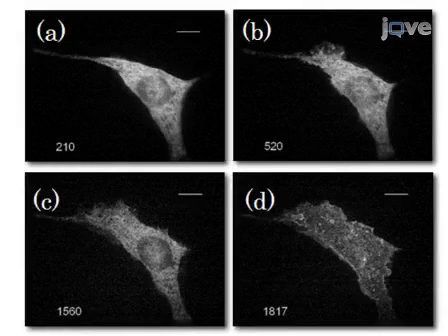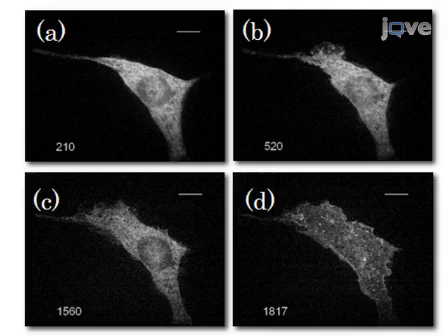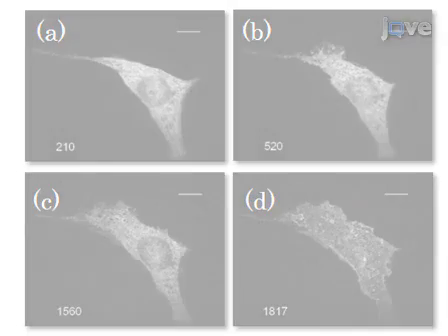Analysis of data reveals highly localized recruitment of the FKBP-fused protein of interest based on its physiological effect. The advantage of this technique over existing methods such as pharmacology and genetics approach is the combination of speed of action, target specificity, and spatial resolution.